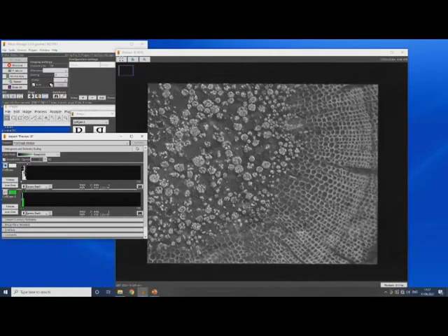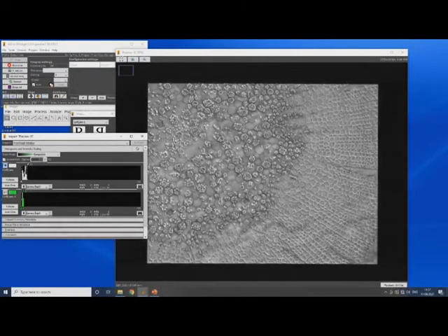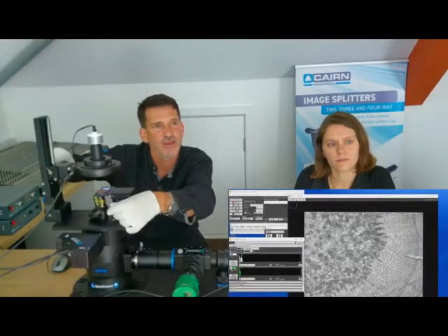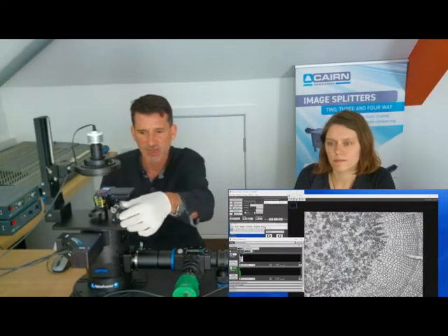There's a slight tweak on the focus, and then you can see as we come up, we're starting to align with the phase ring and seeing some increased contrast from the fact it's a phase objective. So it's rather a neat illuminator. You can pick out different structures and maximise the contrast you want.